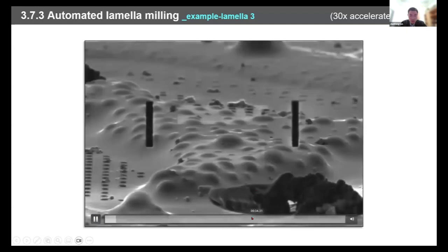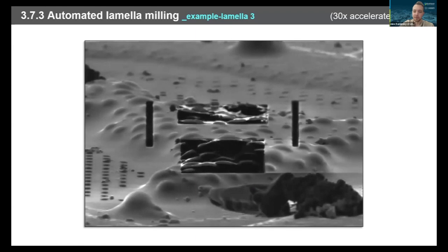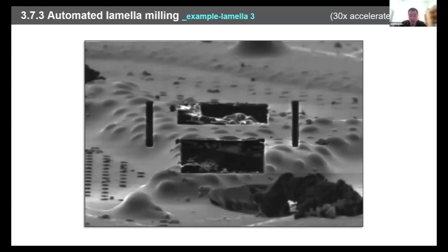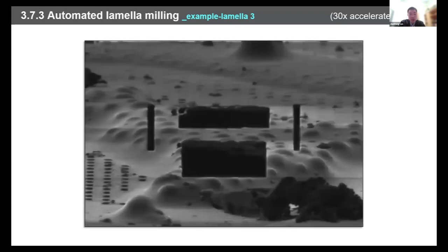Oh, we have a quick question. Did you mean contamination can accumulate 20 to 30 nanometers in a couple of hours? I didn't know. Even though I mentioned 20 or 30, that is not really a reality. I didn't try to measure, but just roughly speaking, along the time, every instrument has some specification result that gives you information about how much ice contamination will accumulate on your surface. That is one piece of information you can look into.